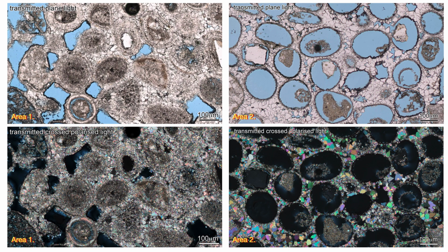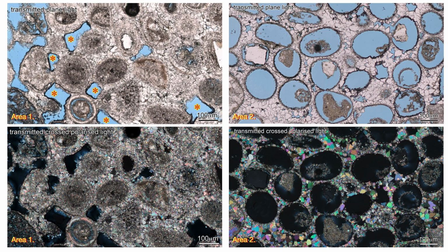The intergranular pores are filled by a mosaic of calcite cement crystals. But this cement in some pores, by the red asterisks, has been dissolved. New pores with black margins cut across the previous cement, much like that described in the Spanish aeolianite.